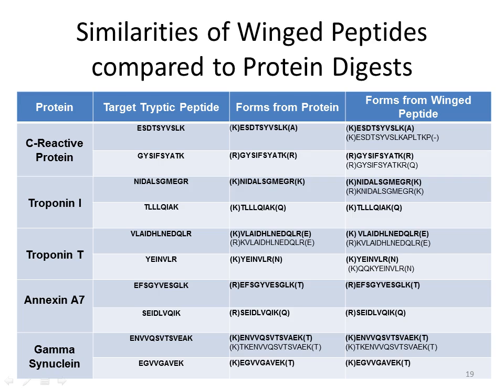When we also observed forms from the wing peptide that had internal heavy amino acids, ideally the wing peptide is acting just like the light protein. We would see the exact same form. So if we saw an alternate form here, we would hope to see the same alternate form from the wing peptide. And in most cases, that's what we saw, with this one exception. In the wing peptide, it didn't cleave off that last 6 amino acid wing, which I could not tell you why.